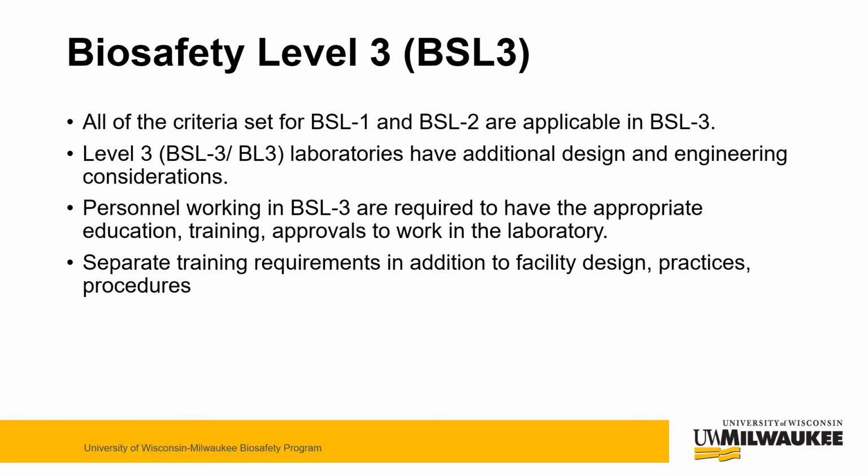All of the criteria set for BSL-1 and BSL-2 are also applicable in BSL-3. Level 3 laboratories have additional design and engineering considerations. Personnel working in BSL-3 laboratories are required to have the appropriate education, training, and approvals to work in that laboratory. There are separate training requirements in addition to facility design, practices, and procedures.